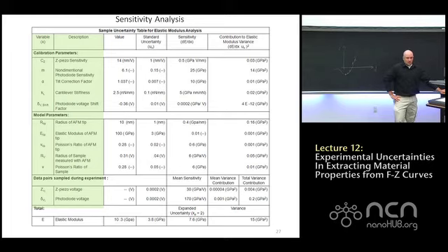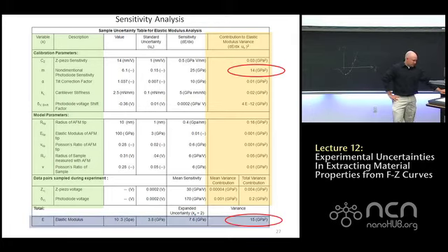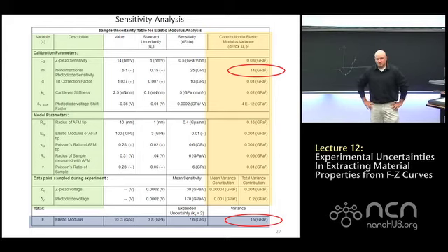We can write out what all those parameters are. And then we can identify which of these parameters are largest, because this is the largest contributor to the uncertainty in E. And we show that actually for this case, the non-dimensional photodiode sensitivity, which was 3% uncertain, turns out to account for basically 90% of the uncertainty we're observing in E.